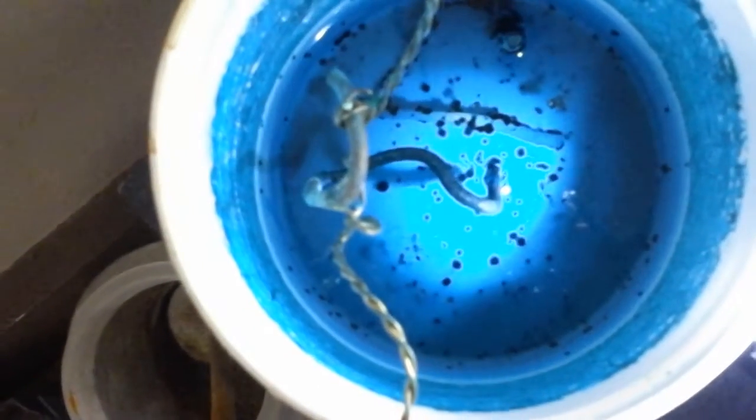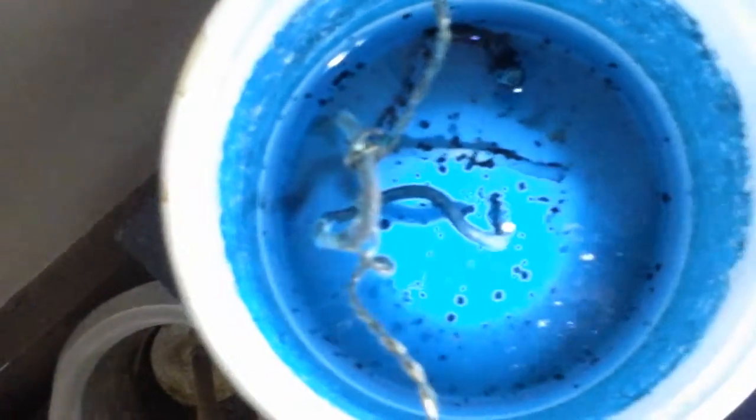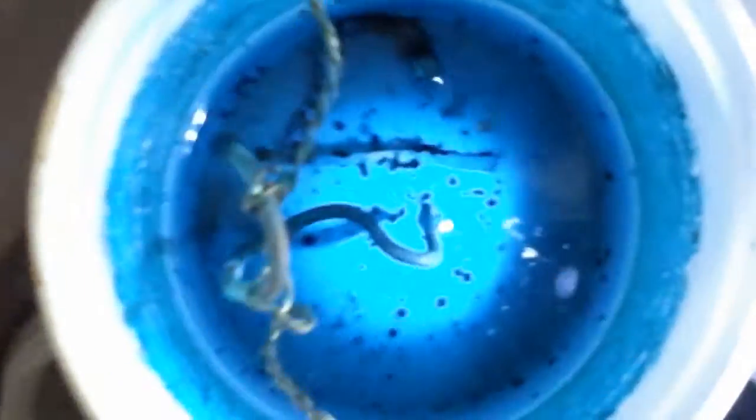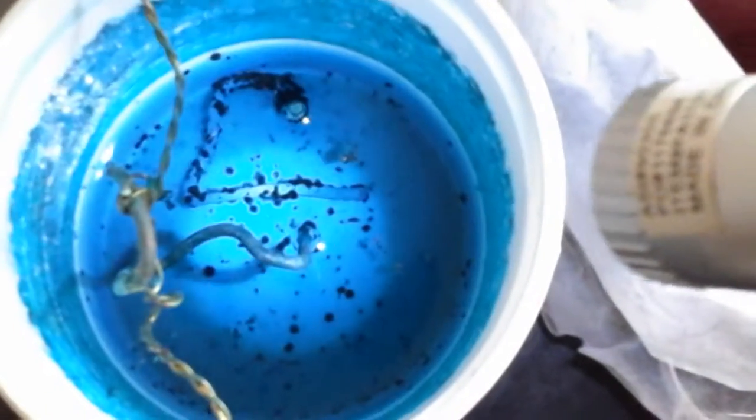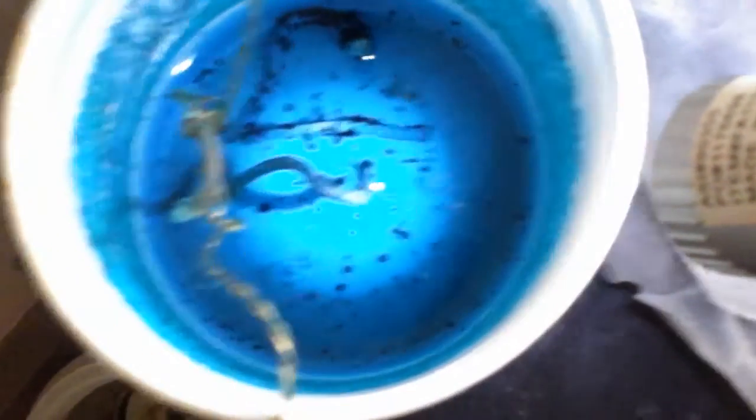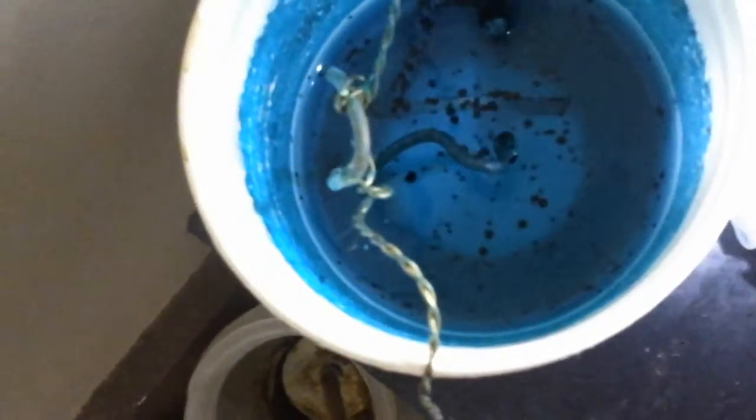check this out guys — I am growing copper acetate crystals. And those are the little, kind of squarish, blackish-blue crystals growing on that chunk of copper — the one that's hanging and the one that's sitting in the bottom. And you can also see them growing on the side of the container.